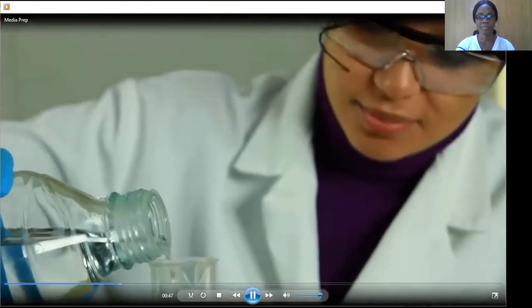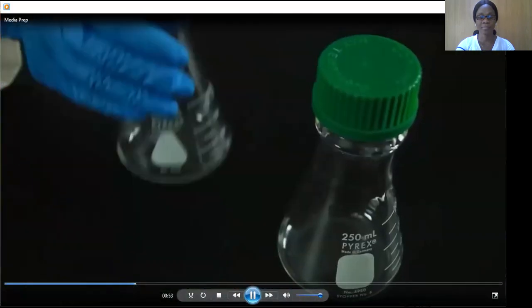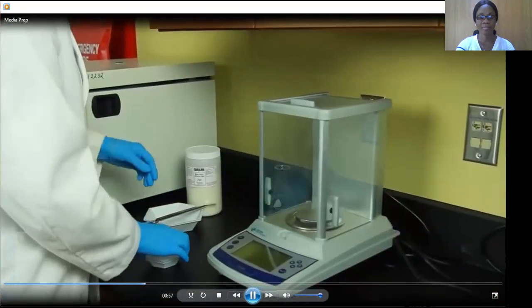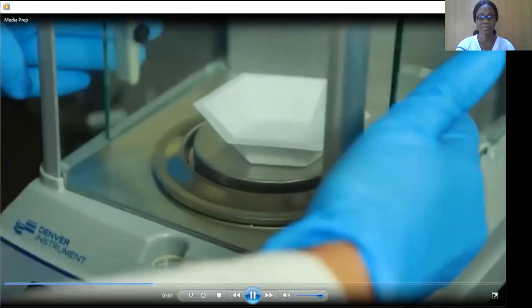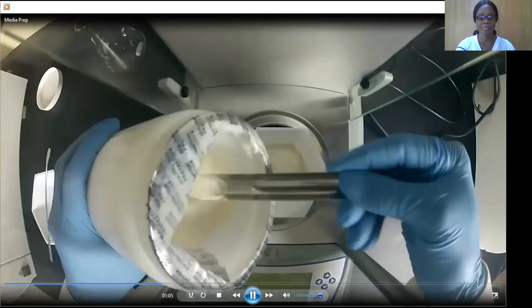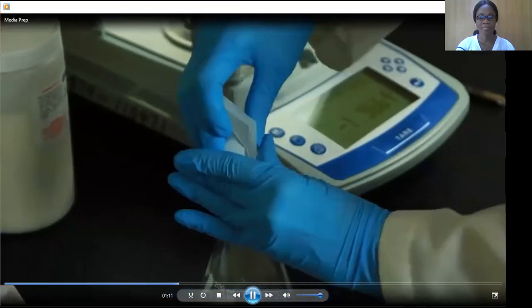First, add 100 milliliters of deionized water to a graduated cylinder. Place a stir bar in a 250 milliliter flask. For the next step, we need an analytical balance. Place a weigh boat onto the balance pan. Press the tare key to zero out the weigh boat. Use a lab scoop to add 5.2 grams of brain heart infusion agar to the weigh boat. Now add the powder to the flask.